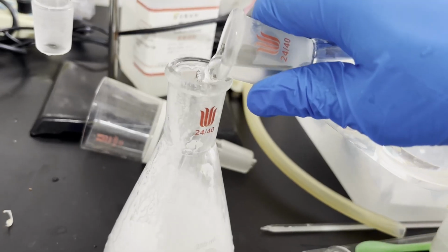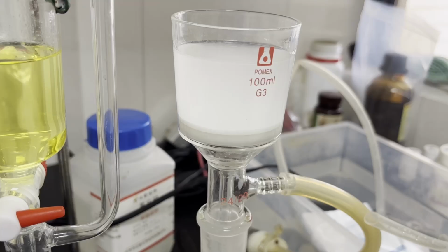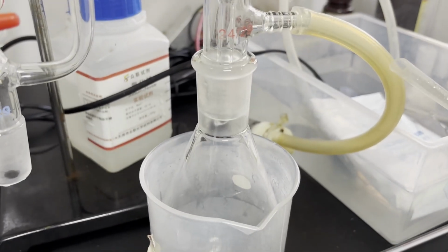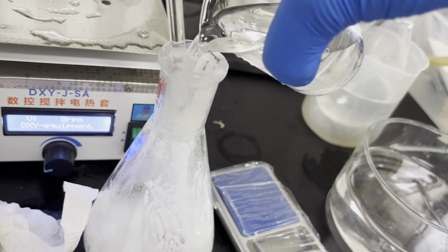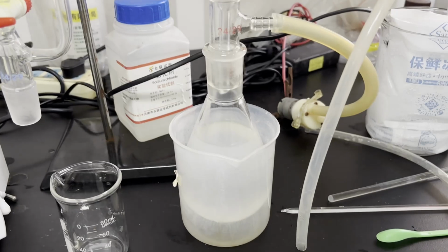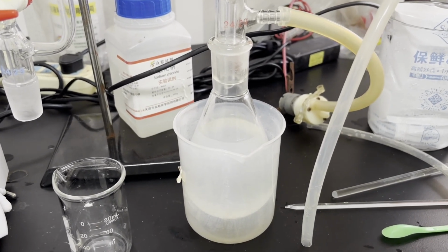The slurry is diluted by more ethanol, shaken by hand, and filtered. The filtration, although still slow, is faster than expected. A total of 240 ml of ethanol is used in all of the washings and dilutions. Finally, a slightly cloudy solution of hydrazine hydrate and ethanol is obtained.